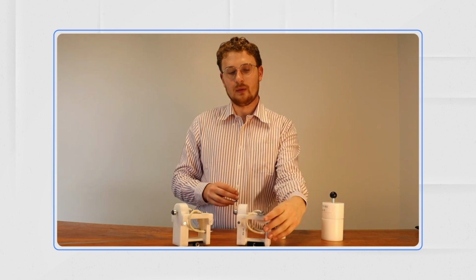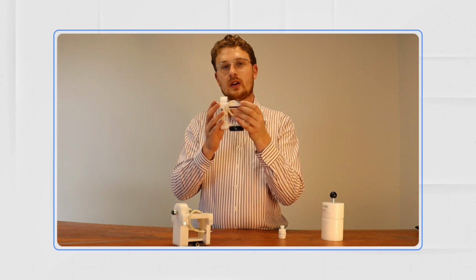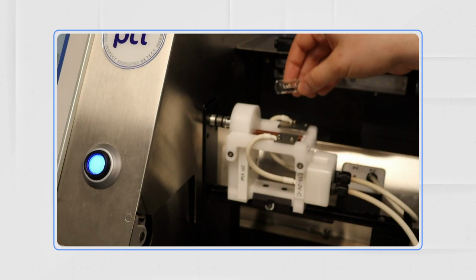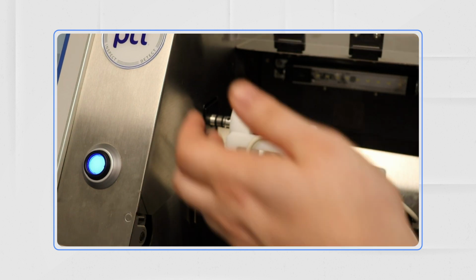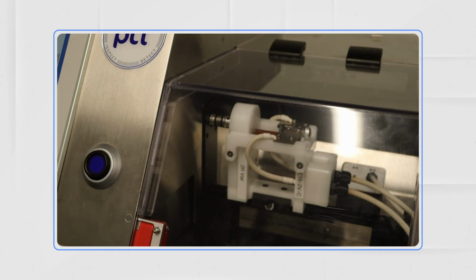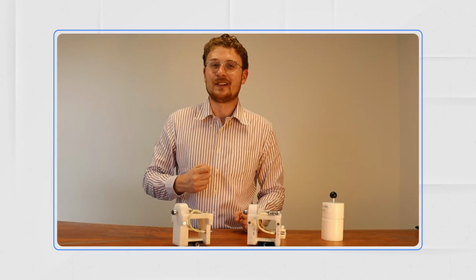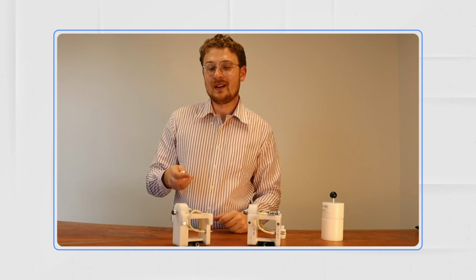Our second attempt was to use an E-scan, our microcurrent HVLD 615 inspection platform. The main challenge here being that we knew the solvent was flammable, so there was some potential that energizing the solvent and putting a voltage through it could cause a fire. So we had to put this in our shipping dock and throw up some fireproof blankets and stuff around it and open up the shipping door and give it a try first, just to make sure that we didn't blow everything up. Luckily, it does work, and rather effectively.